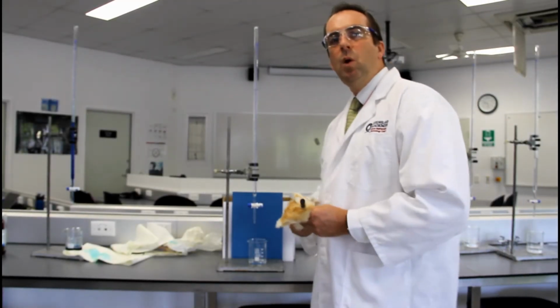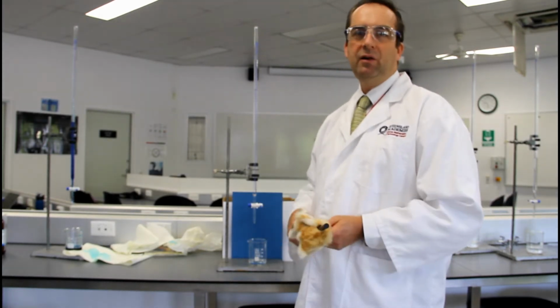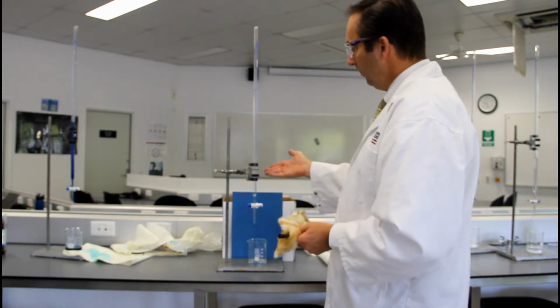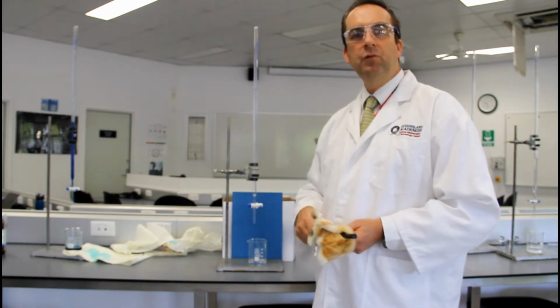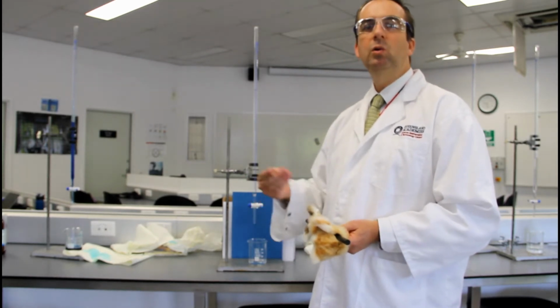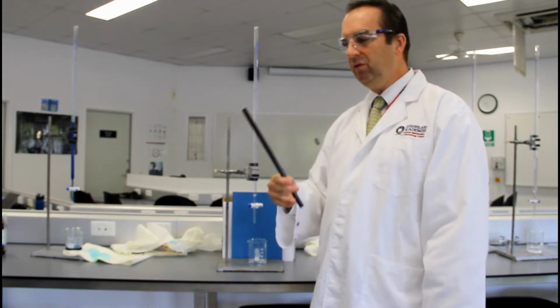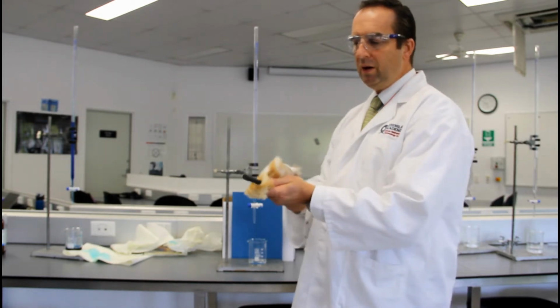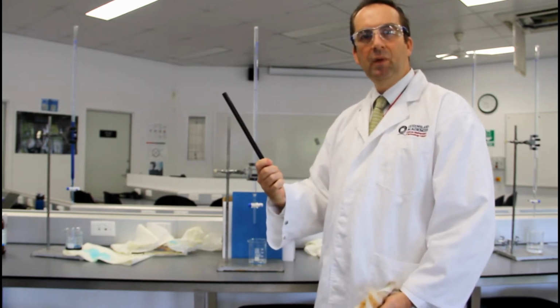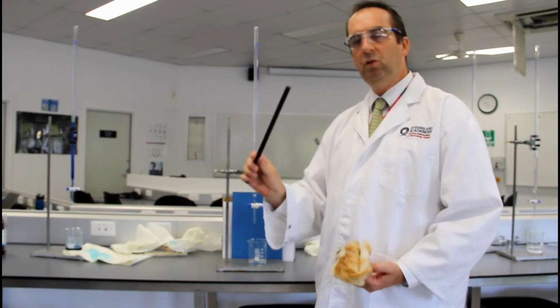Hi students, what we're going to look at today is an application of molecular polarity. I've got 4 liquids here in burettes that we are going to look at. First we'll look at the structure of the molecule, find out if that molecule is polar or not, and then we're going to see if it will be attracted to a charged rod. So I can charge up the rod here, and if the molecule is polar, it should be attracted to the rod.